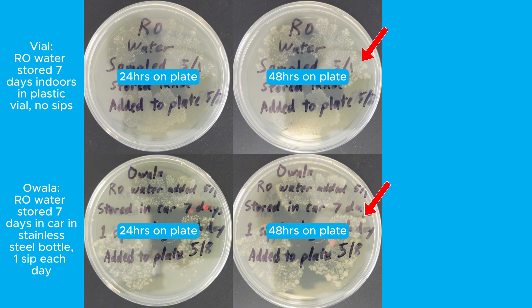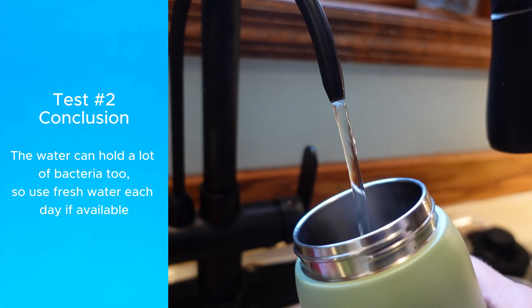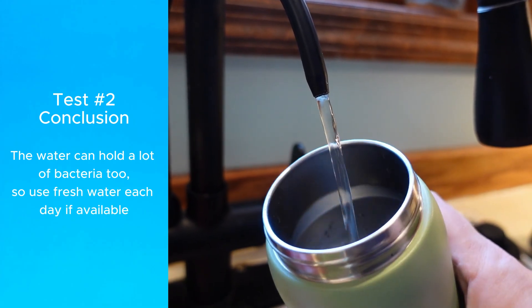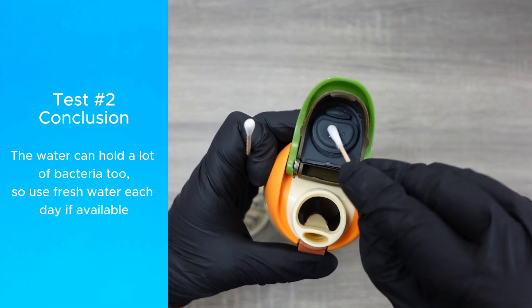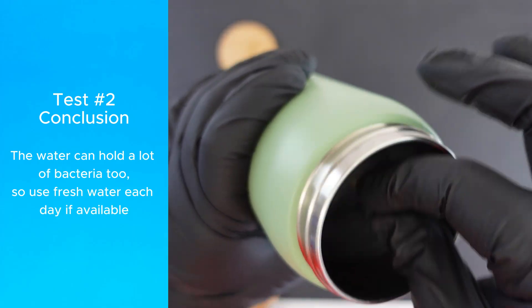After two days, the colonies on both samples had grown even more, but the Owalla was still a lot worse. Interestingly, on day three, they kind of look similar to how they did on day two, but the main takeaway is that the Owalla sample was always worse. This is why it's also a good idea to refill your bottle with fresh, clean water every day if you can, because it's not just the surfaces on the seals and the spout that build up bacteria, they can also exist in the water.